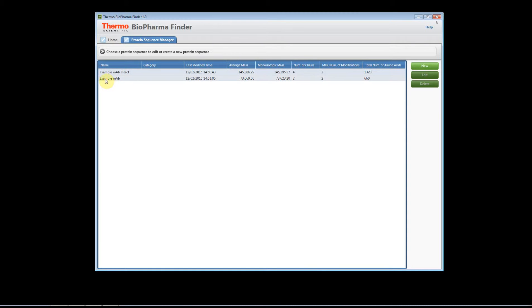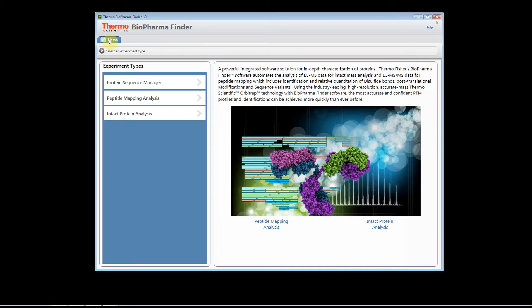So we've already added an example sequence and now we're going to go back to the home page and we're going to select peptide mapping analysis.